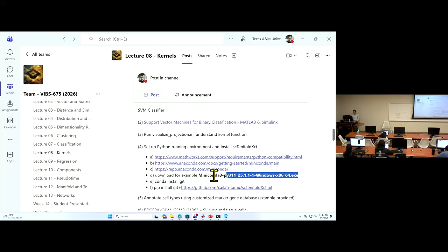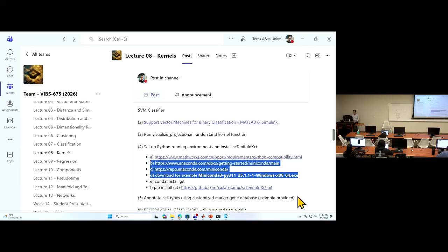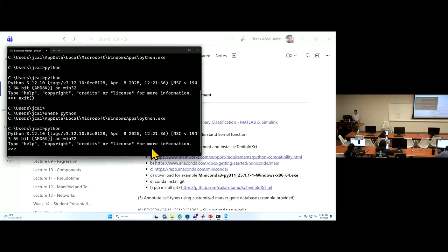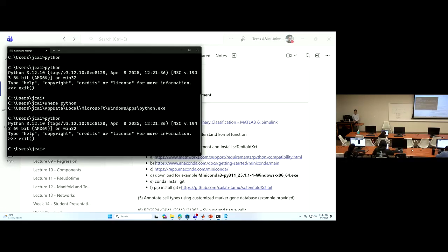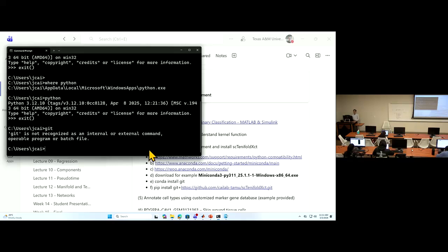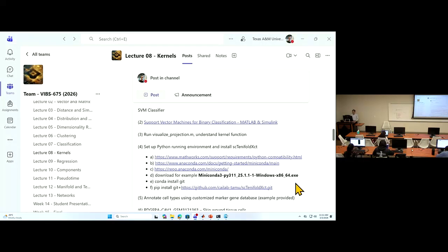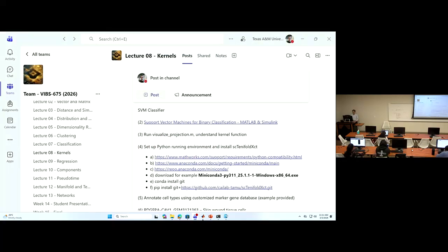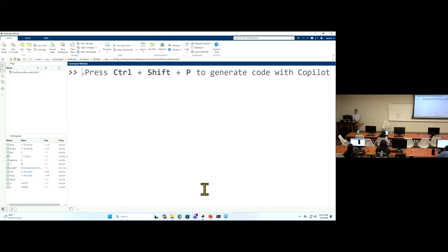So we don't need this, because we can install Python itself directly. Okay, assume I have that installed.